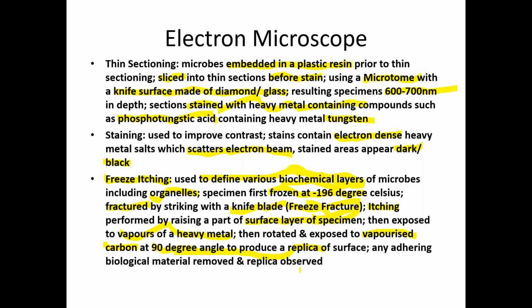Maybe it may get damaged, because in thin sectioning, as already explained, the specimens are embedded in a plastic resin. So you will have a plastic coating over the specimen in thin sectioning. If the plastic coating is not as thick as required, with a particular diameter, thickness or molecular size, when we are going for thin sectioning, maybe we will get some artifact formation. That's why I explained in the beginning.